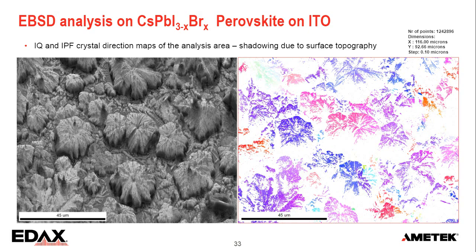Those are white. But interestingly, all those flower-like structures index with a uniform orientation. So there's no dendrites, there's no original crystals growing in different directions anymore. The sintering completely recrystallized all those grains.